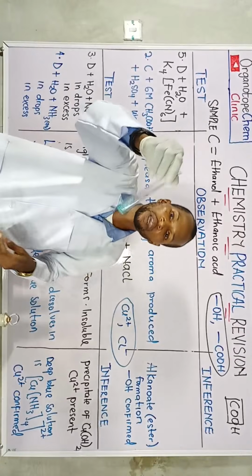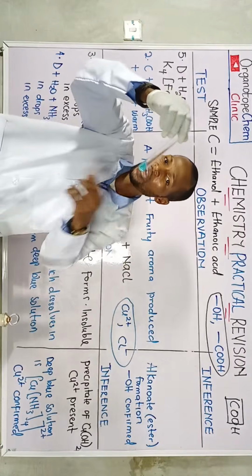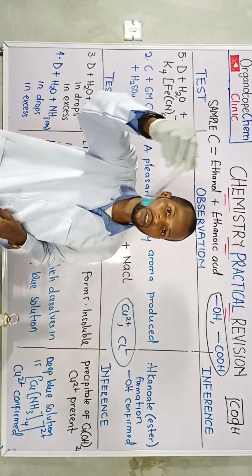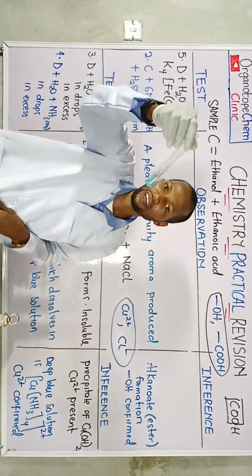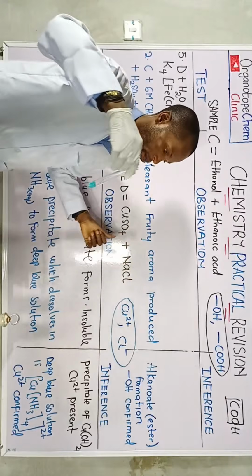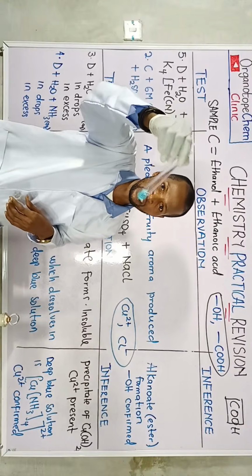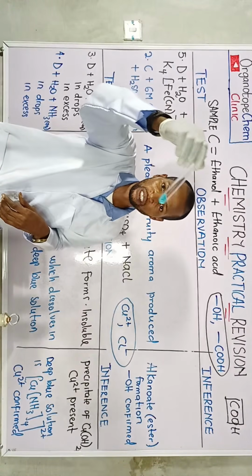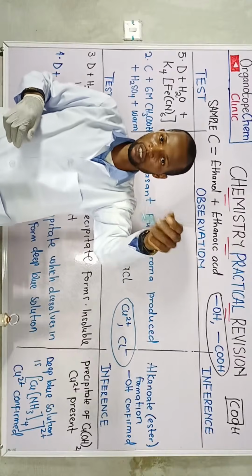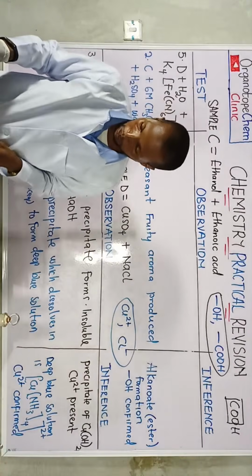Now, you know we are having a mixture of inorganic salts. The reason why we are not seeing the required change, assuming the test is conducted on copper(II) sulfate directly, is that there will be no masking of the copper by sodium. So copper has been masked by sodium, okay? But the desired observation is what we are going to write now. We expect to see a reddish brown precipitate formed.